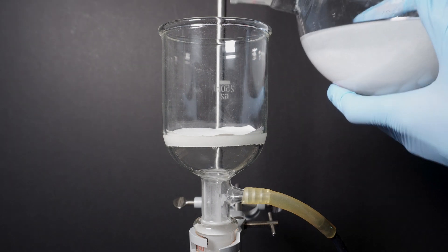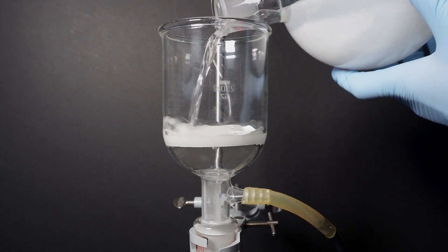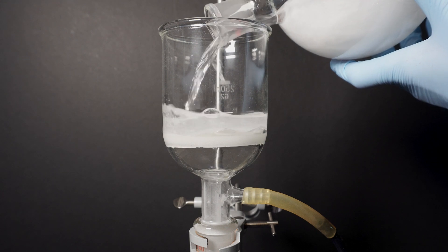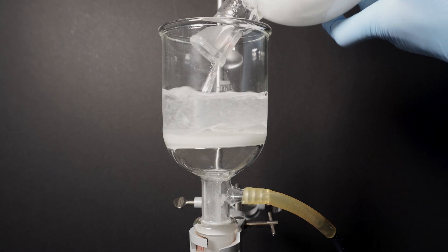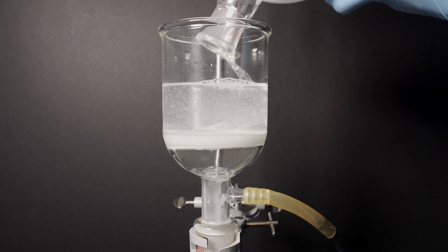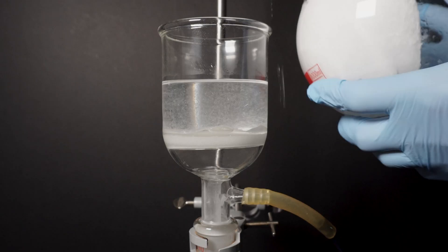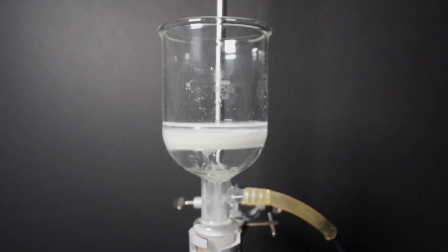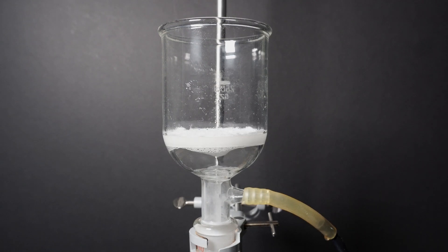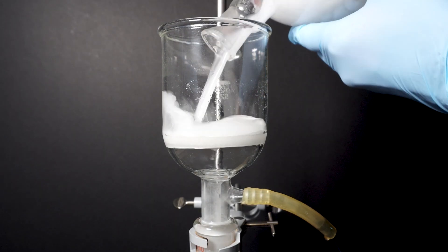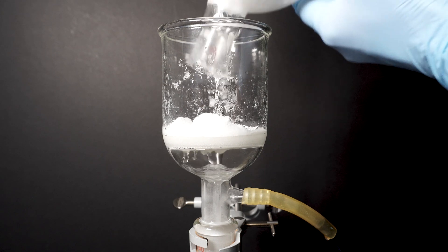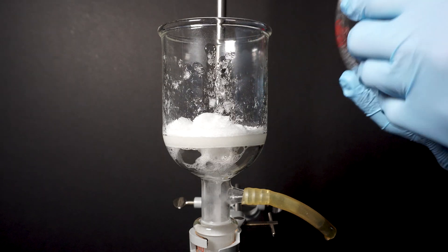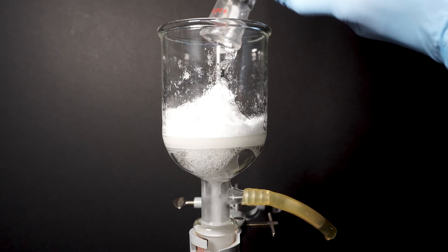Next I vacuum filter off the crystals followed by washing them three times with 250 milliliters of distilled water. This is to remove any leftover hydrochloric acid or acetic acid that still remains on the crystals. I also wash the flask two times to remove most of the crystals. I left the crystals under vacuum for something like 10 minutes before moving them to a dish to air dry for 24 hours.